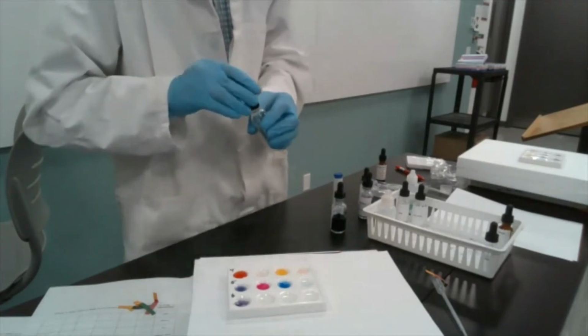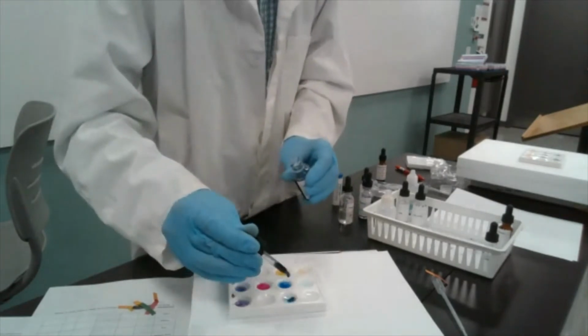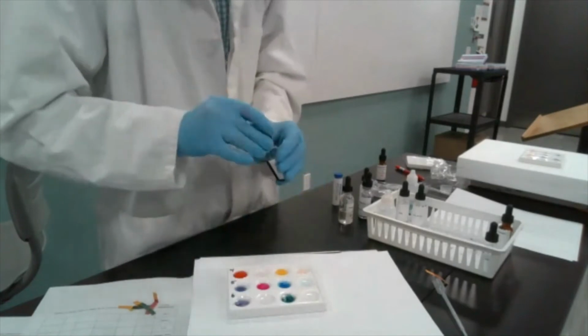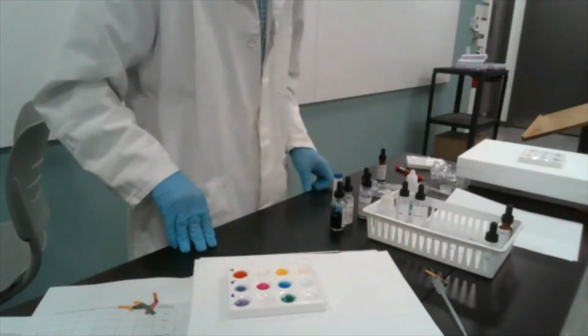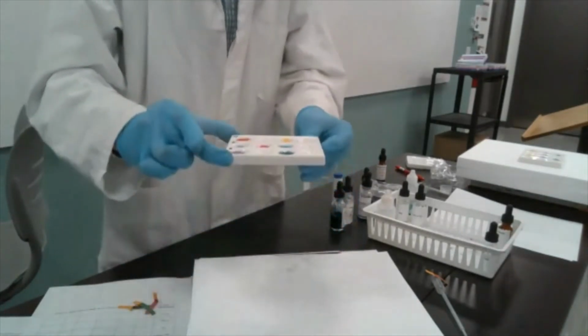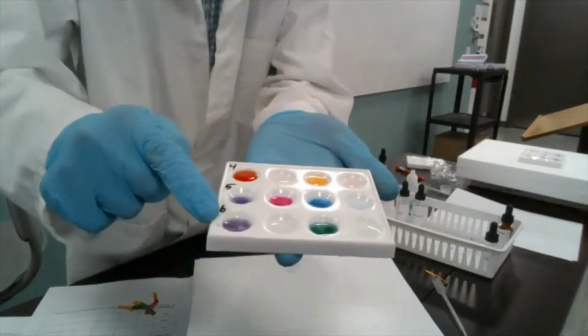So I'm going to add some phenolphthalein here. And finally, I'm going to add bromothymol blue. And lastly, we're going to do the universal test, but in a moment. So this is what we're looking at.